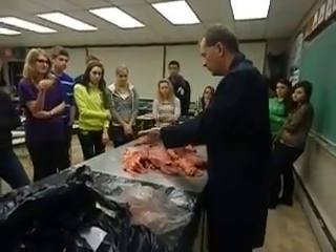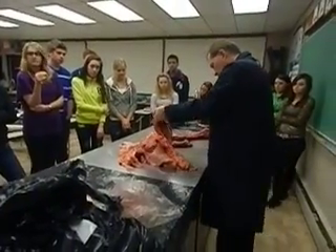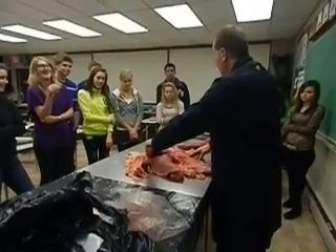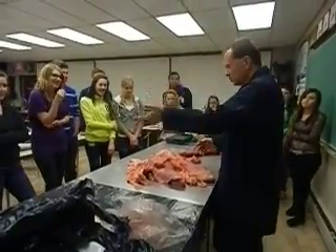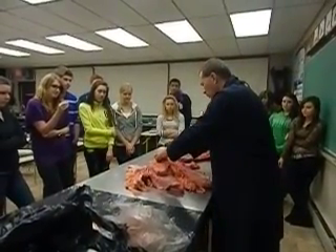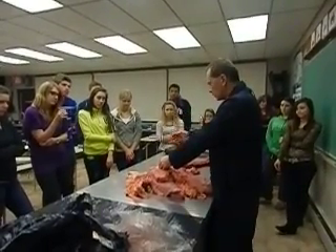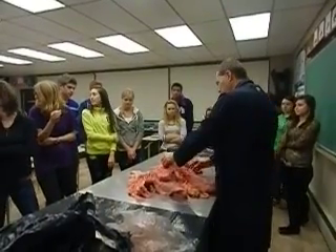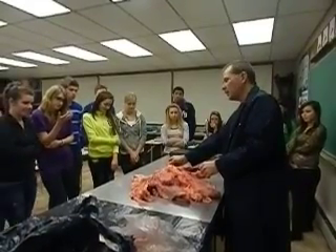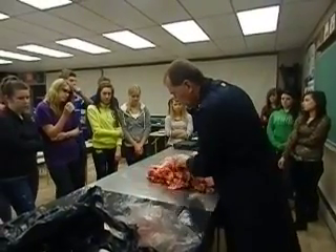But there's a lobe — you can see that's different, right? There's a lobe right there, and over here, here's one, and there's one. So again, I don't know if it's two and two or three and two — it really doesn't matter. But that is a lobe. Anything else I can show you here? We've been talking about blood vessels, and as we're going into the heart we're going to be talking about blood vessels, arteries, and arterioles. You can see right there — that is a connective point. To me that looks like it is not an artery, that is just a vein of some sort.